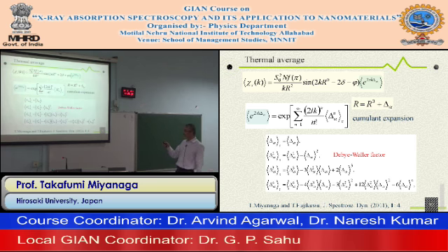It is interesting that the first order cumulant has a k-first-order dependence, so this effect is not distinguished from the average length, which also has the same k-first-order dependence.